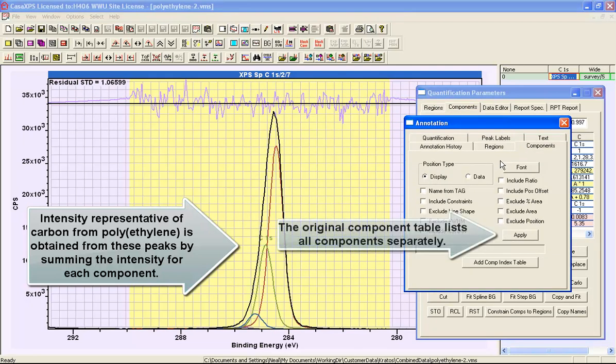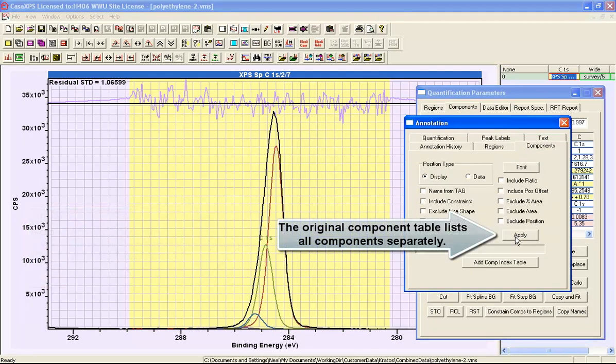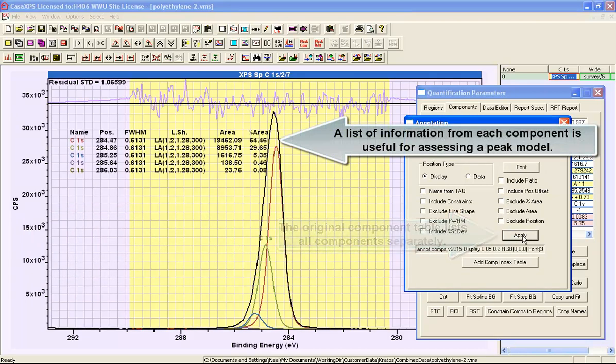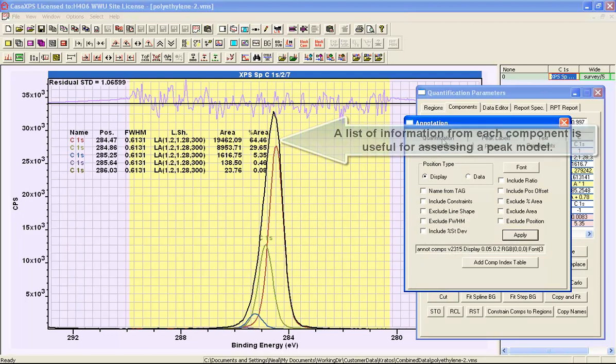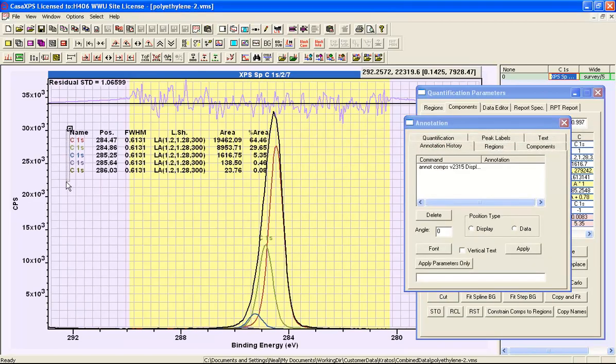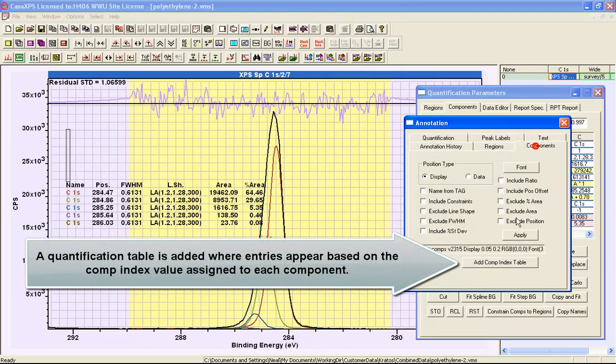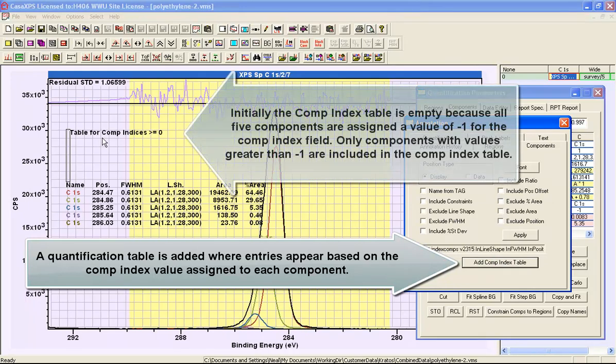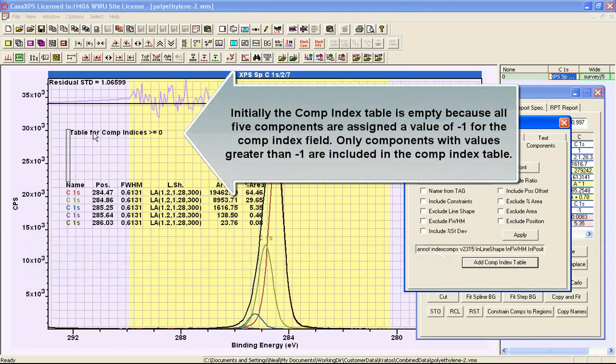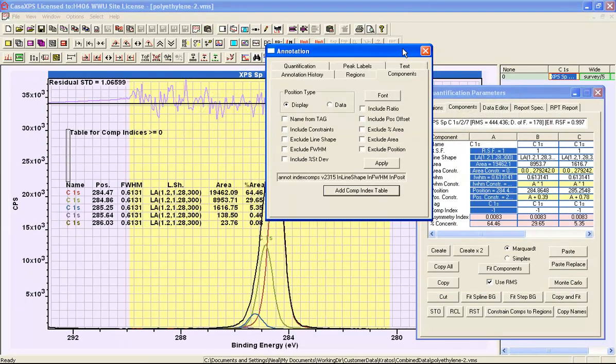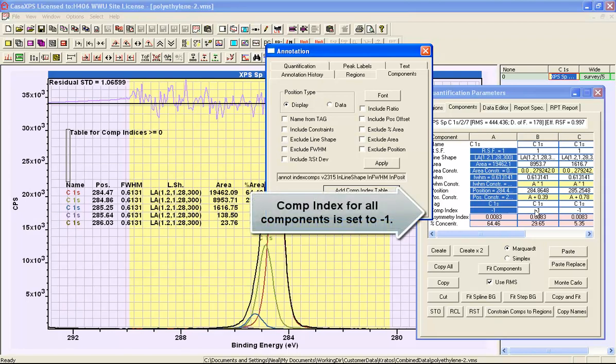We can do that using the annotation dialog window and the components property page. The standard report for components is obtained by pressing the supply button and you can see the individual peaks have been reported. Let me just move this so that the next table appears in the place that I would like to see it. And that is a table that is constructed from information gathered based on component indices. So if I press this report, then I end up with a table which is populated with no entries at the moment, and that's because it's going to make use of these parameters here that are the component index and they're all set to minus one, which is not in the range that is used within this report.